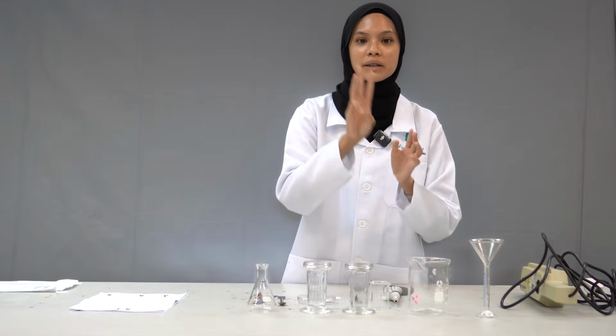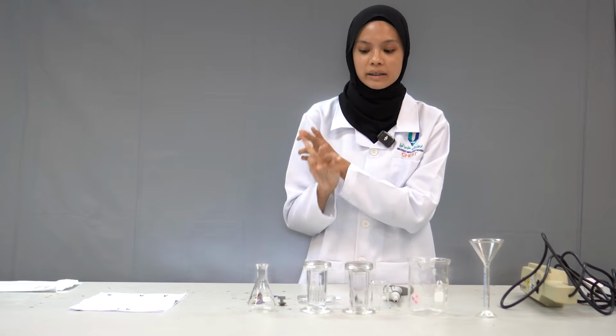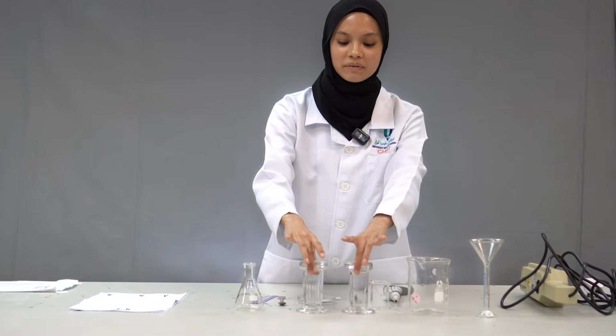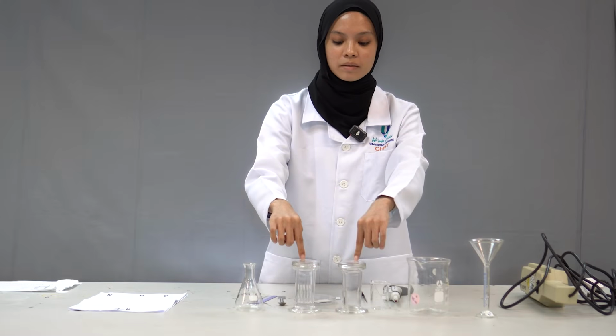These are the apparatus that we are using. We are using three different compounds: the acidic one, benzoic acid; the neutral compound, camphor; and the basic one, p-chloroaniline. And then we have the flask to put in the liquid substance, the developing chambers with two different solvent mixtures, and the TLC plates, which are the stationary phase.